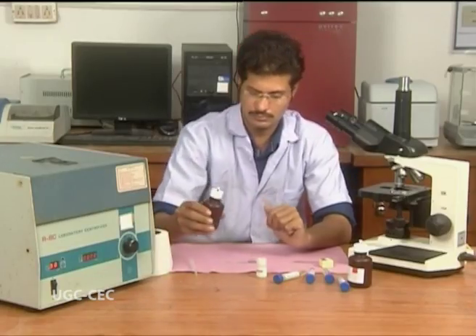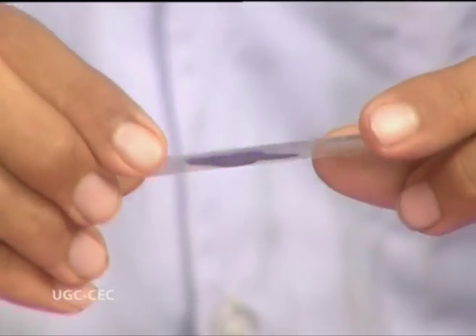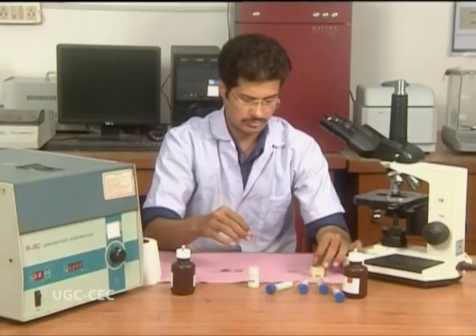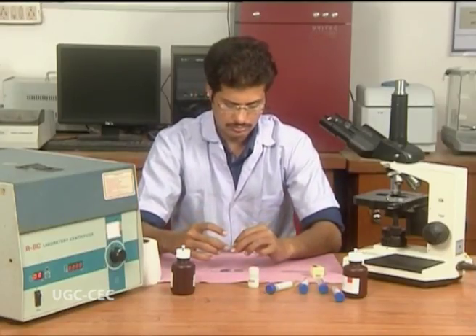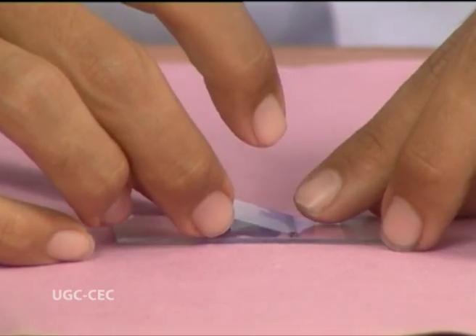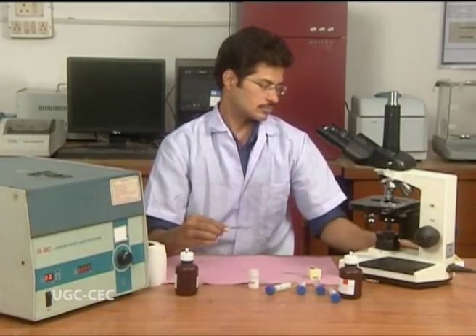Stain it with a suitable stain, and observe under the microscope.